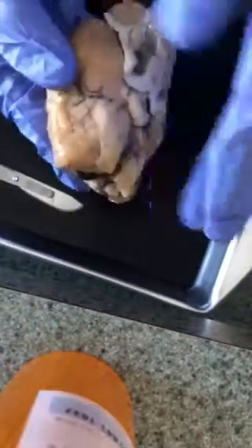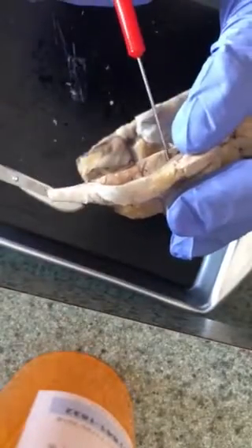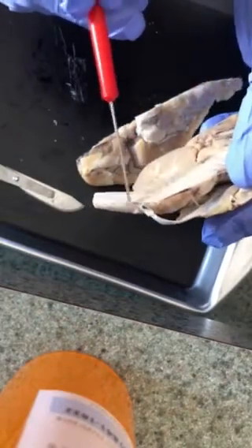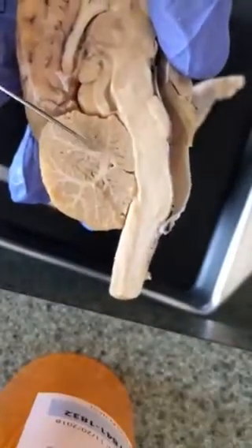And then once it is actually dissected, I kind of have a connective tissue structure here. So we have the pons, the medulla, and the spinal cord. So pons, medulla, spinal cord. And then here is the arbor vitae.